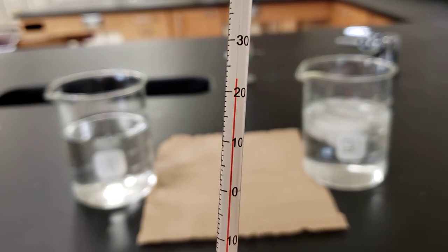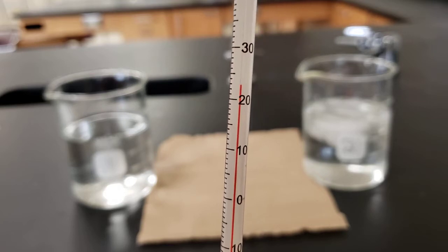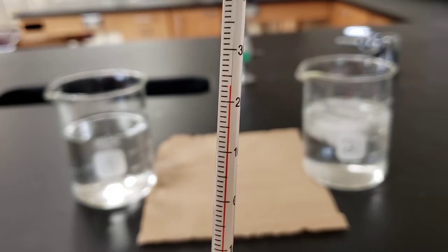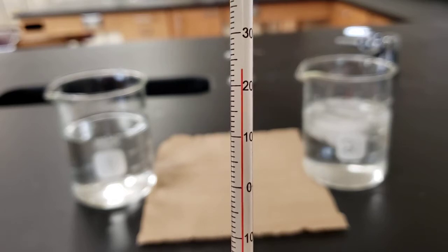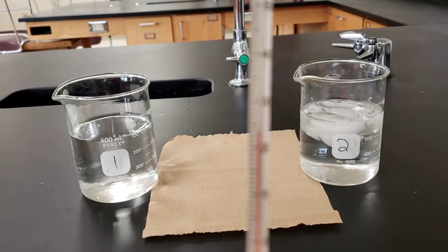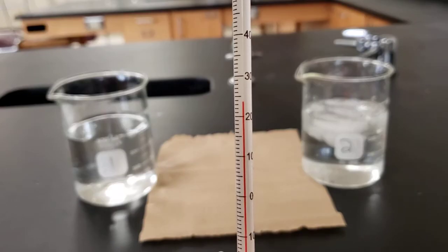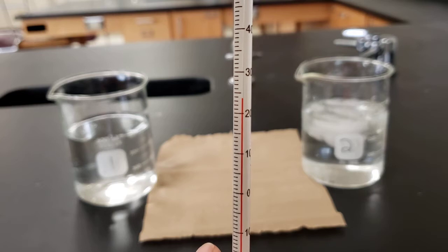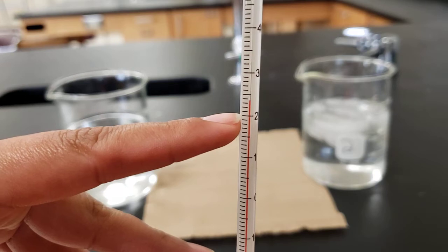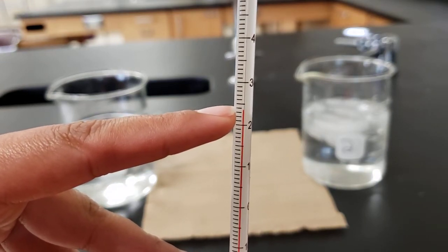Whenever we are reading the temperature off of a thermometer, it's similar to reading liquid volume in a graduated cylinder. We're going to find the closest number, and then we're going to count up or down from there. For instance, right now I have my hands on the bulb, so it's warming it up a little bit. If I leave that on there another second or two, you notice that the number it's closest to is 20. If we count up the lines from there, we go up 1, 2, 3, 4 lines. It's almost up to 4.